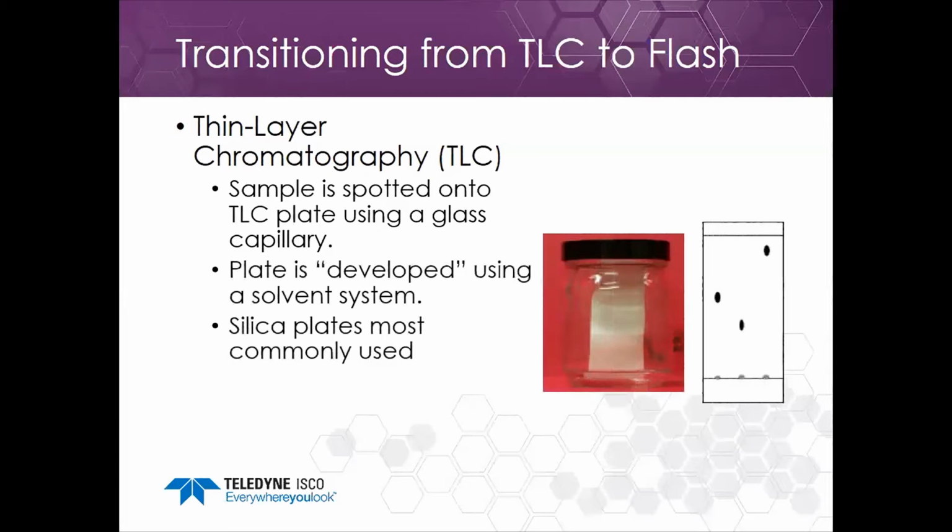and then we develop the plate and try to visualize our compounds. Once again, silica plates are the most commonly used, but we do offer plates for the other stationary phases that we offer as flash columns.